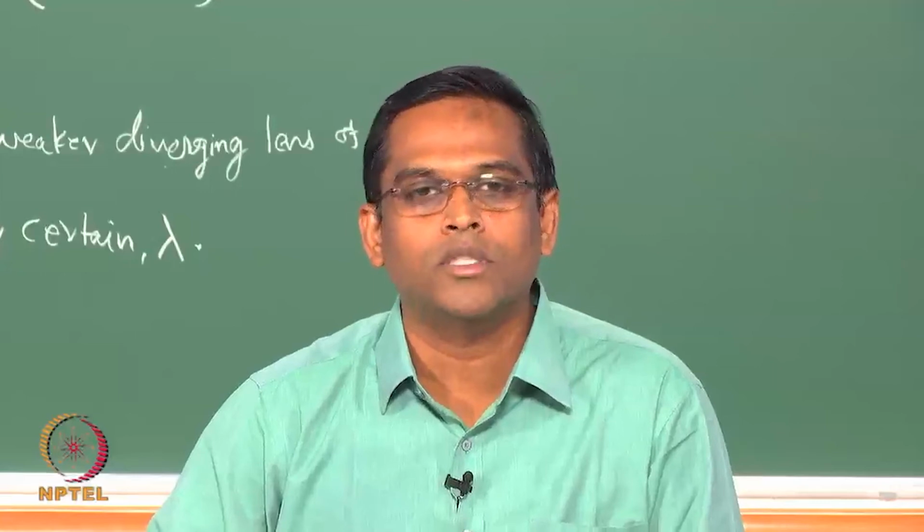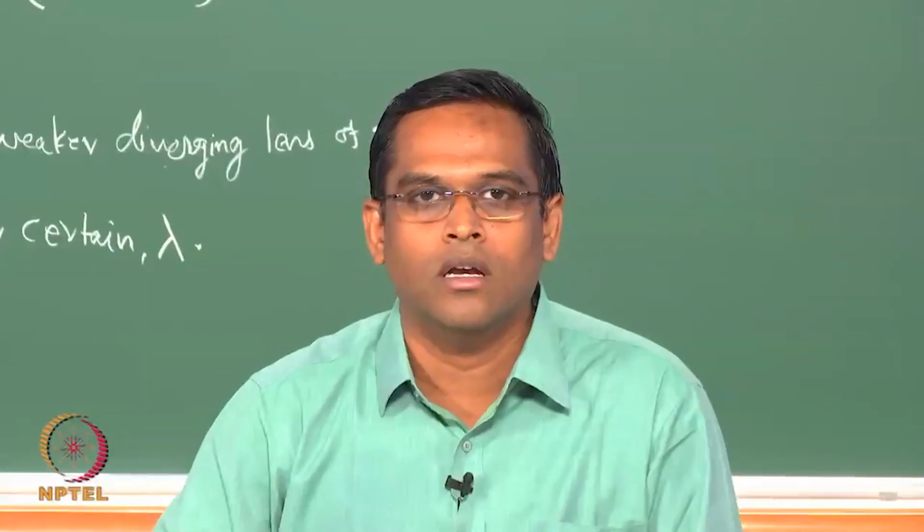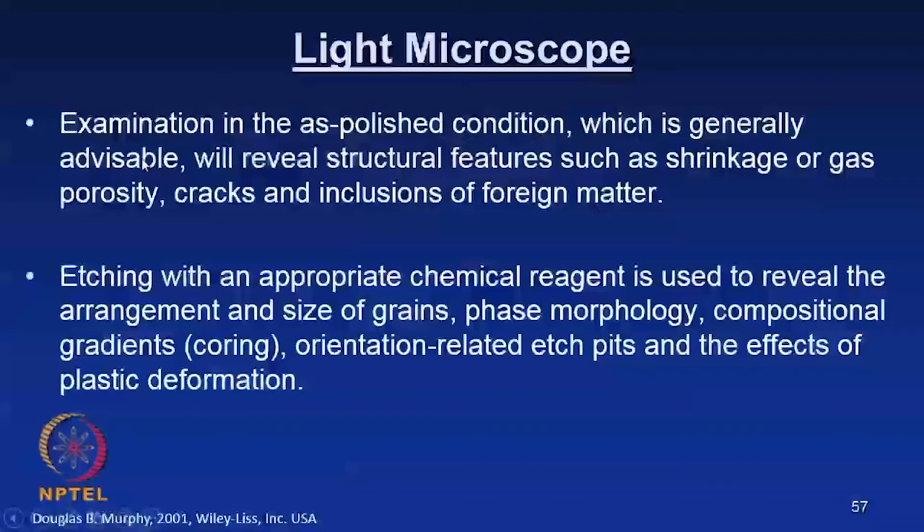So, now I am going to describe what a general light microscope does, and I will also take you to the lab and show some videos of actual light microscopes which we have in our laboratory. So, let us look at the description of a light microscope. Why do we use this light microscope?